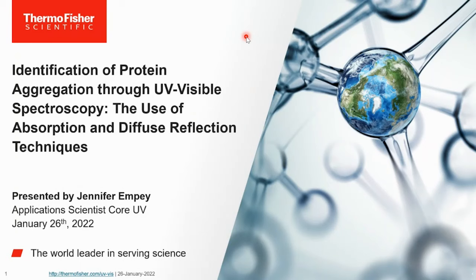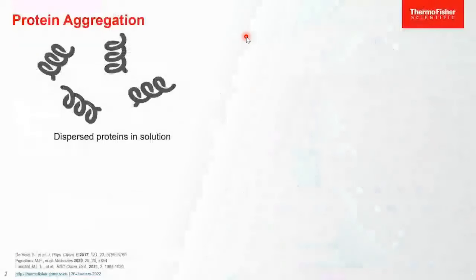My name is Jennifer Empey, and I work with Thermo Fisher Scientific as an application scientist supporting the Thermo Scientific Core UV visible spectroscopy instruments. And today I'll be talking about how you can identify protein aggregation using UV visible spectroscopy.